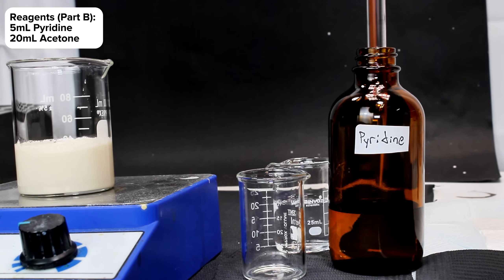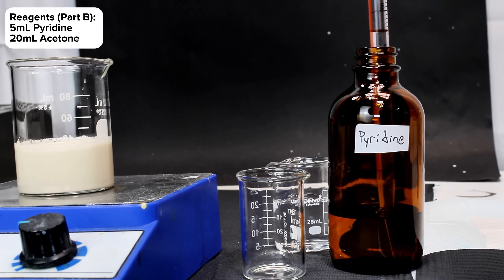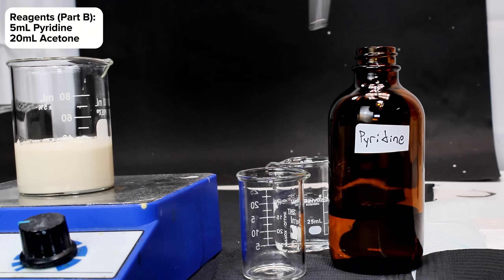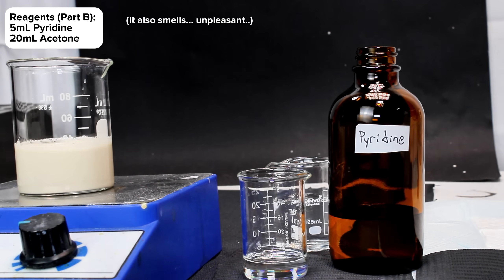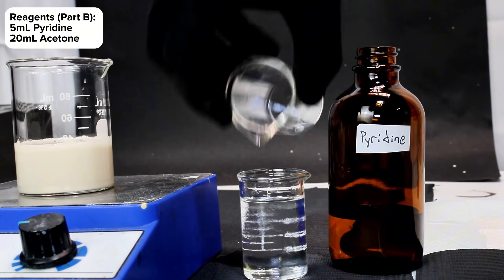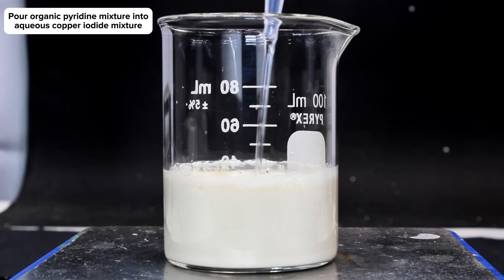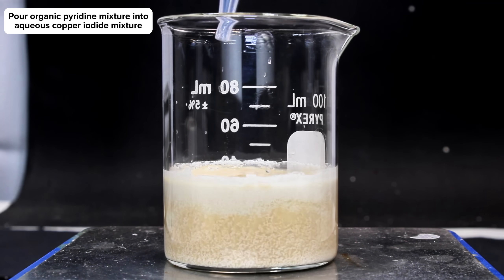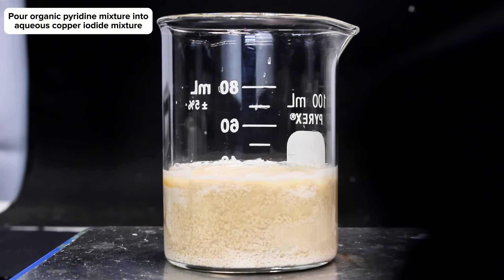In a separate beaker, I then combined 20 milliliters of acetone along with 5 milliliters of pyridine, which represents a significant excess. Keep in mind that pyridine is quite toxic, so take care when handling it. Once the two are thoroughly incorporated, the mixture is poured into the beaker containing the copper iodide mixture under constant stirring. As soon as the chemicals combine, there is a strongly exothermic reaction accompanied by some intermittent color changes.